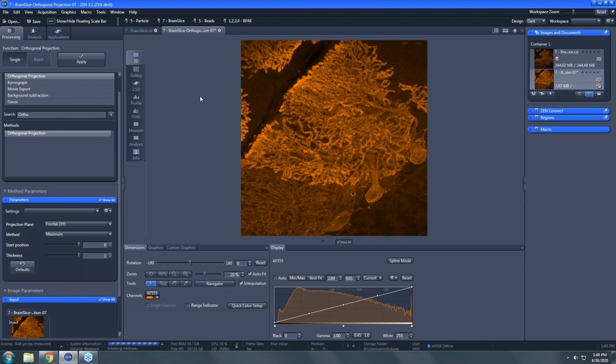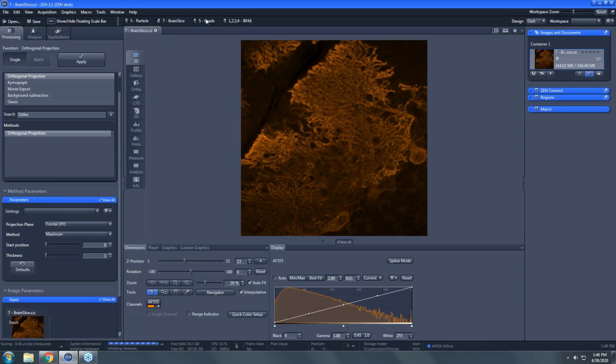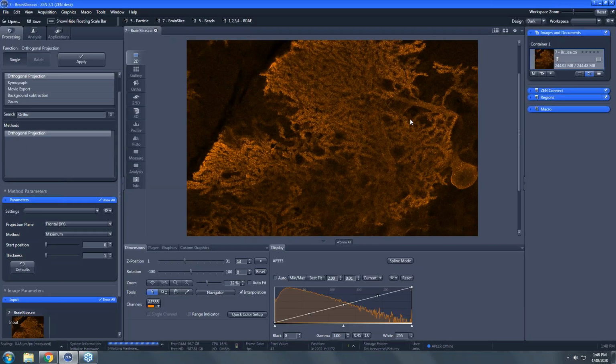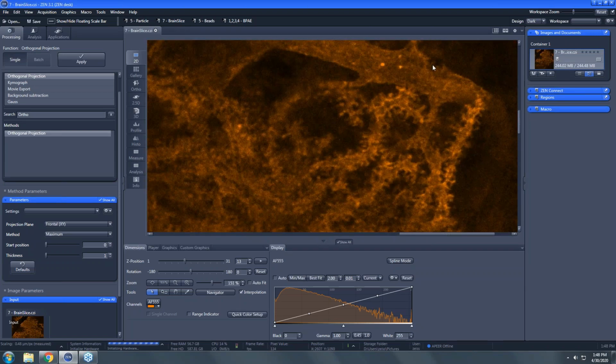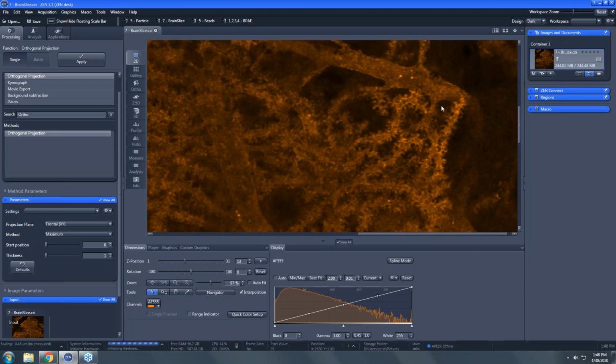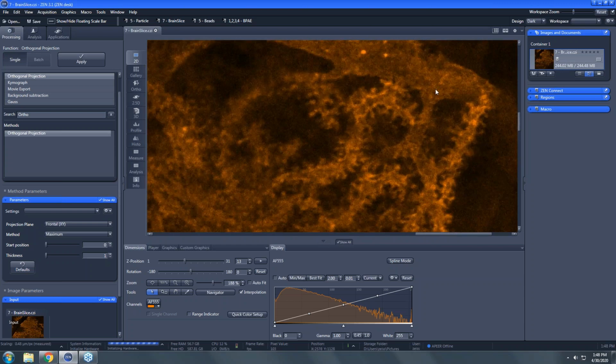So let's close the MIP here, if we would, Nicole, and then zoom in really close to that Z stack and find an interesting region. And let's just take a look at the really kind of pixel level intensities and what's going on there. Right in this area the best. Yeah. Even more. Go in even farther. All right. Even farther. Yep.